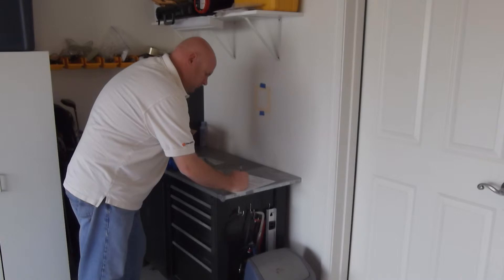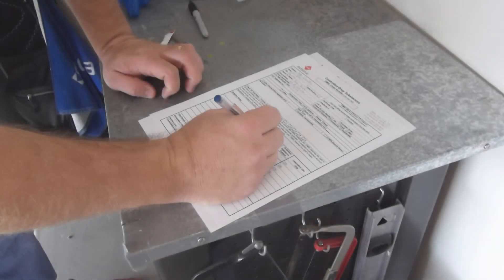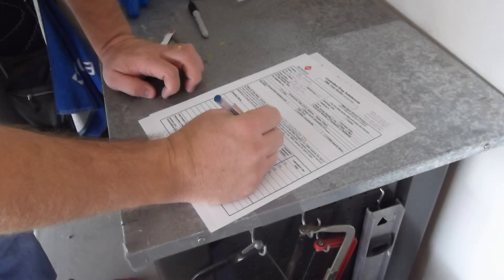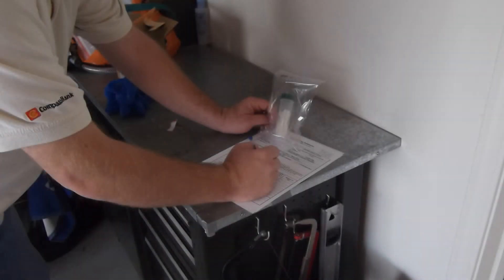Record the sample information on the chain of custody form. All of the information requested on the form should be filled out. This form must accompany any samples sent to the laboratory.